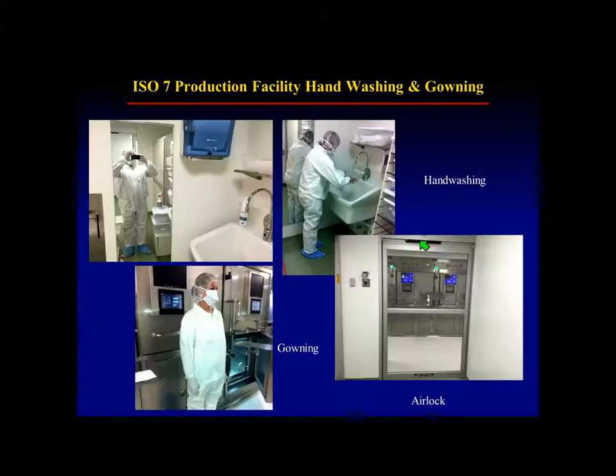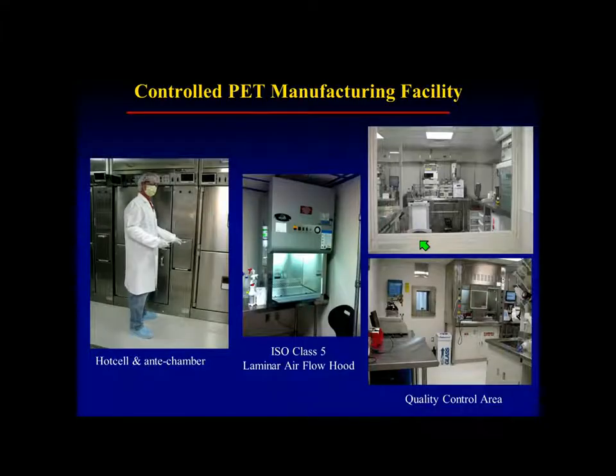But one other thing, this is our quality control lab. And you're actually looking into this room through a glass window. There's another one of those laminar flow hoods in there where we do our sterility testing. And they want us to keep that area where we're doing sterility testing essentially restricted so that we don't have people walking near these flow hoods to compromise the air quality.